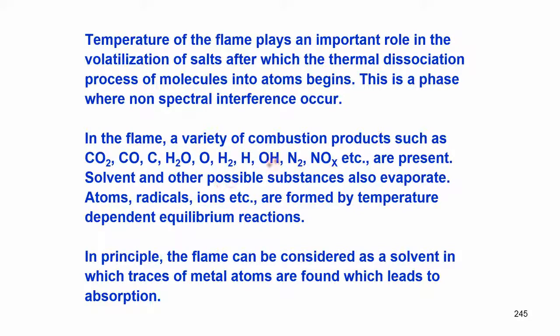Here you can see that there are species like carbon, oxygen, H, OH, etc. These are not stoichiometric combinations of the elements, so they cannot be classified as compounds, but in the gaseous state these species have been detected in the gaseous space.